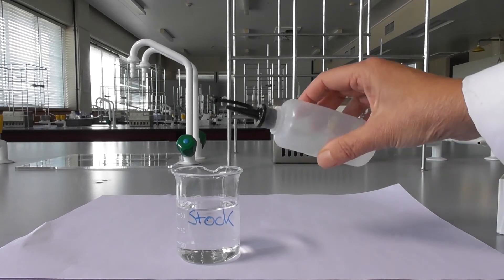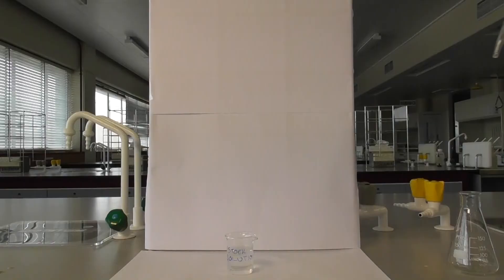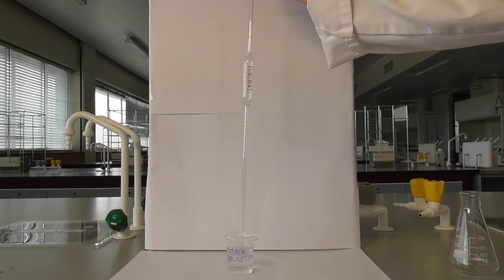We've added phenolphthalein to our stock solution to detect a change in the pH. This pipette looks clean, but it hasn't been rinsed. The small amount of residue left on the pipette is enough to contaminate the entire stock solution.